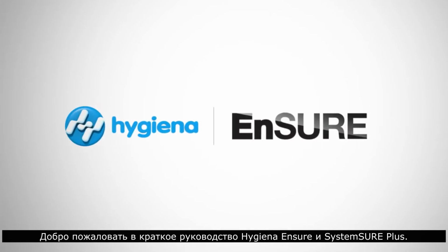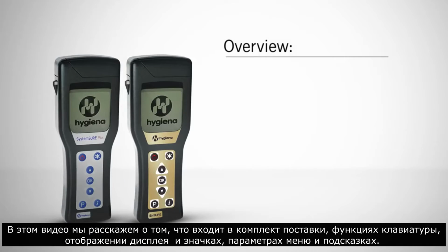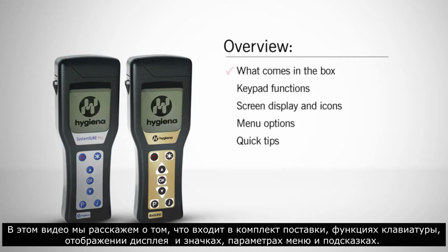Welcome to the Hygiena EnSURE and SystemSURE Plus Quick Start Guide. In this video, we will cover what comes in the box, keypad functions, screen display and icons, menu options, and quick tips.